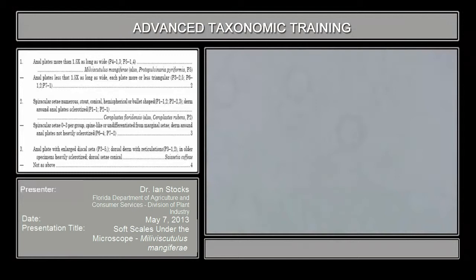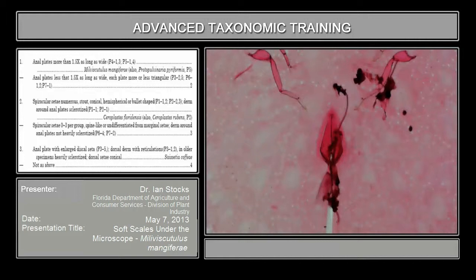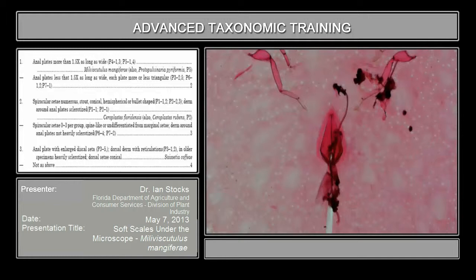We can go back to Milviscutulus mangifery and run through the key. This is obviously a fairly contrived key with a very customized set of taxa here. As someone getting a slide in from wherever, the key that you have access to may read differently in its starting. But for this one, I chose to start with the shape of the anal plates, because they're a very solid, easily seen character that can quickly move some groups out of the way.